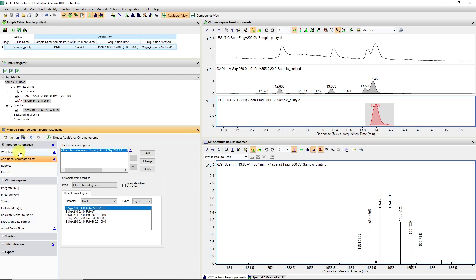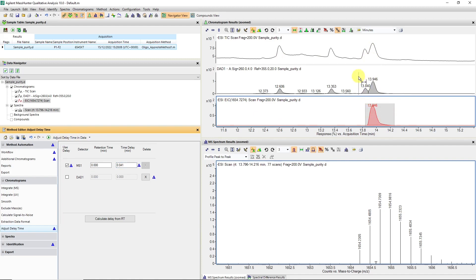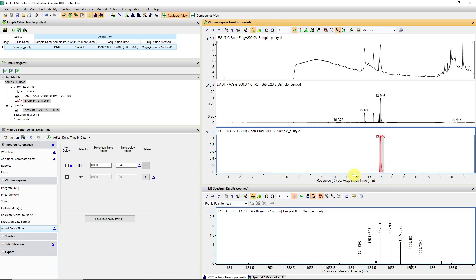We're now going to adjust for that delay so we can do a peak purity calculation. We use the left menu in method automation — there's an option under chromatogram saying 'adjust delay time,' where we can shift the MS time. We plug in a value, which is simply the difference between the two peak retention times. After clicking adjust delay time, the TIC and the extracted ion chromatogram traces have moved, and you can now see which peak needs to be integrated. Our target peak is at 13.9 minutes.